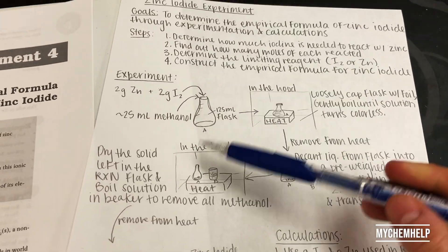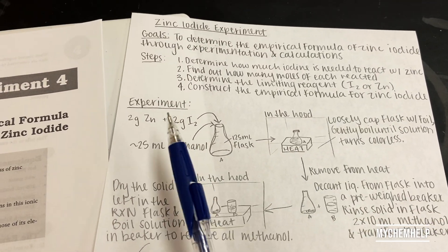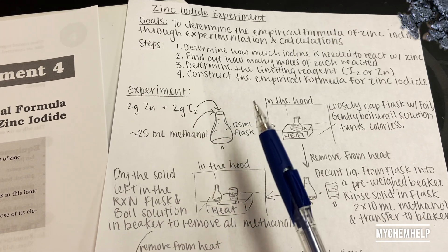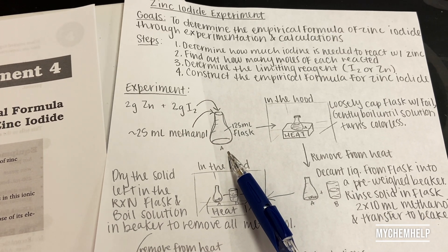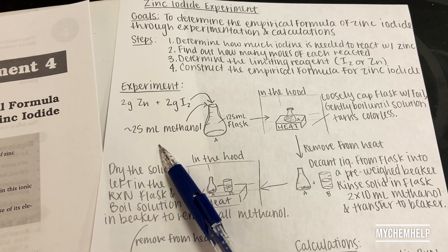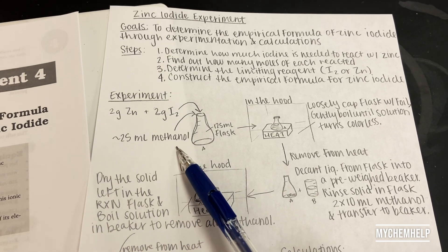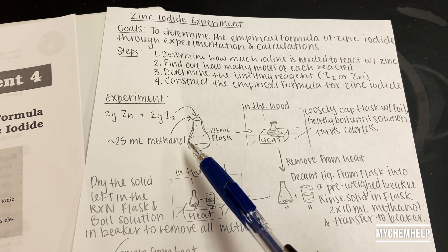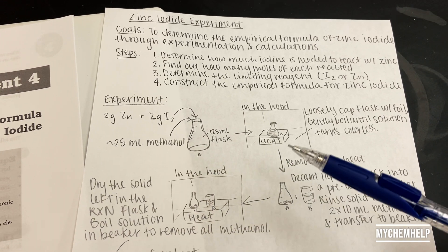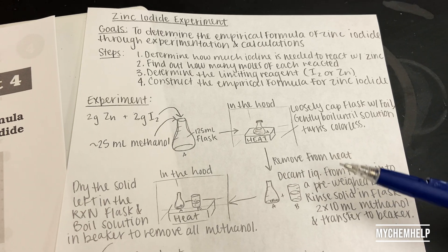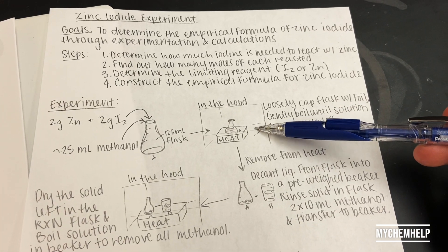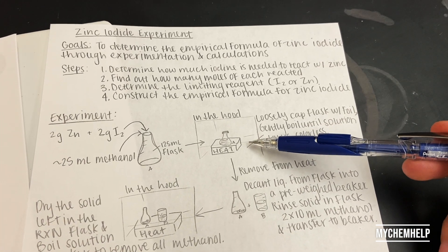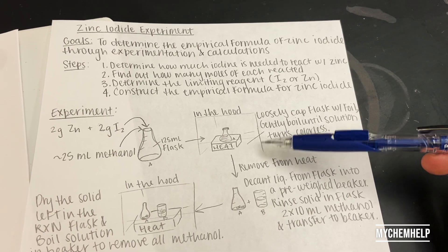The experiment looks like this: we're going to add about two grams of zinc and two grams of iodine into a flask with 25 milliliters of methanol. The methanol is not really involved in the reaction — it's just the vessel for the reaction to take place. I'm going to do this inside the hood because methanol is toxic.